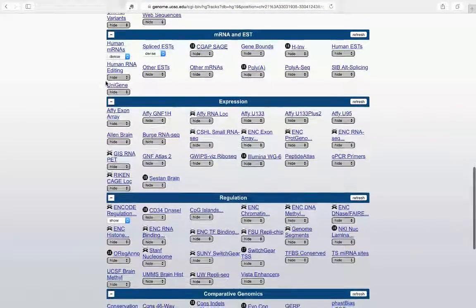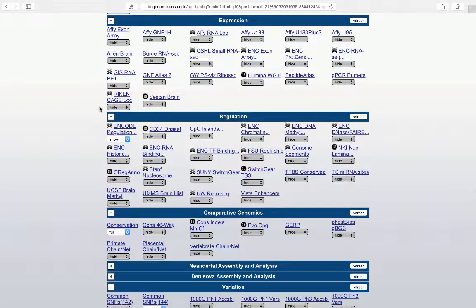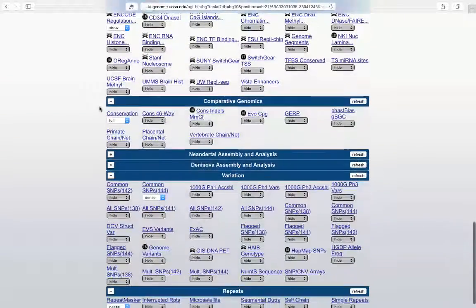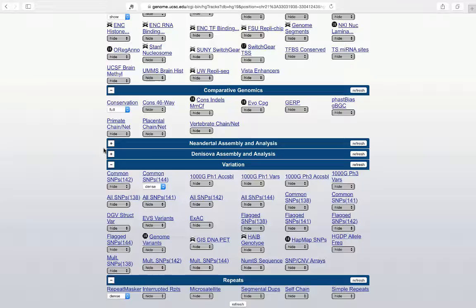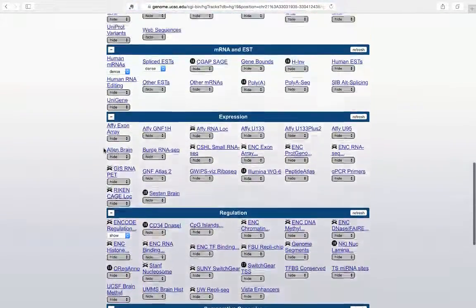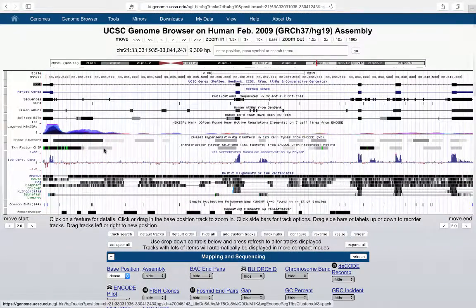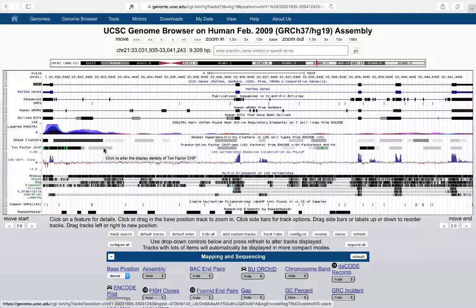In the track controls, you can see dozens more tracks available — far more expression data, regulation data, variation data, and comparative genomics data. That's one reason HG19 wasn't introduced at the beginning. Ultimately, you want to become familiar with HG19 and comfortable working in it, because most data you'll be interested in will likely be found here for the foreseeable future.